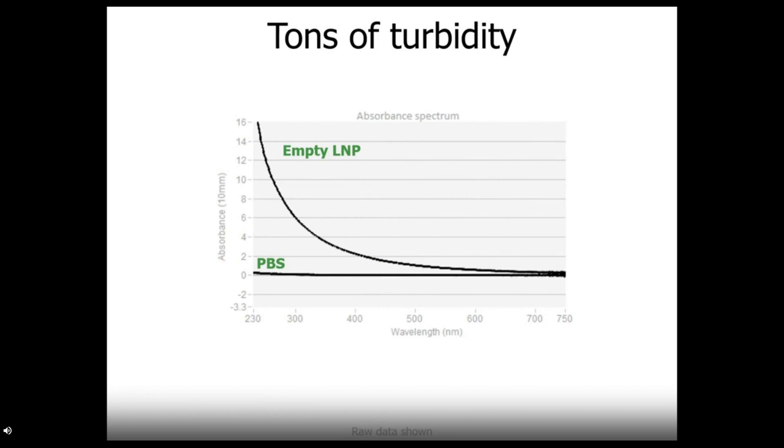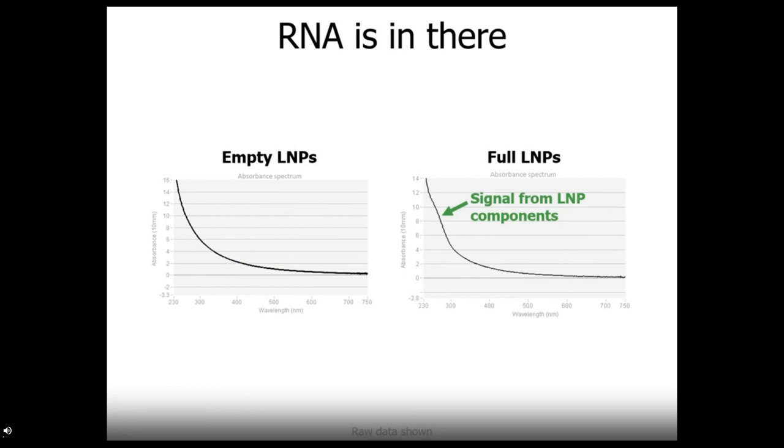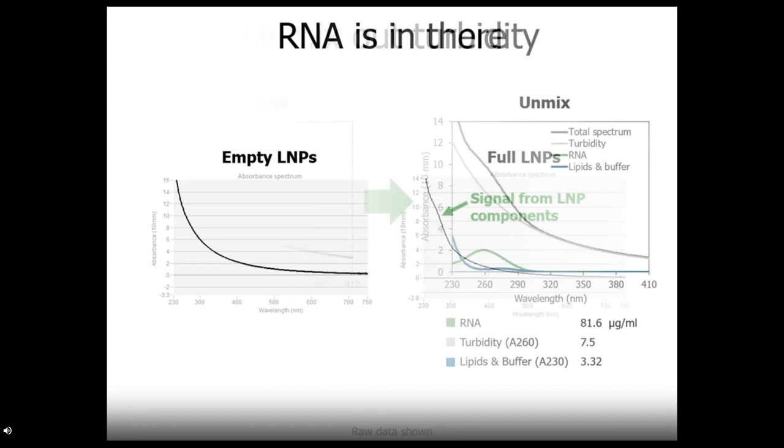Here's a quantitative look at all that turbidity, shown by comparing the signal from an empty LNP, so one that is not loaded with a nucleic acid, to a PBS buffer. These LNPs create a whole lot of signal that looks like absorbance but usually isn't helpful and just gets in the way. Because all that turbidity makes quantifying with traditional UV-Vis almost impossible, total RNA quant by UV-Vis is normally a big challenge. For example, if we squint at the full curve, we can see the RNA bump at about 260 nanometers, but the difference is pretty small. To analyze this, we have to separate out the signal from the turbidity, from the signal from the LNP absorbance due to RNA and other LNP components.